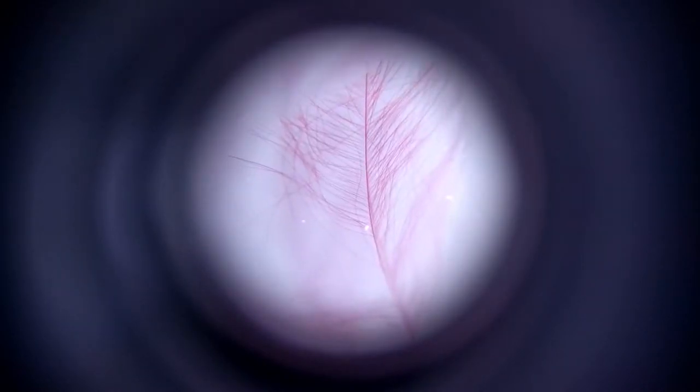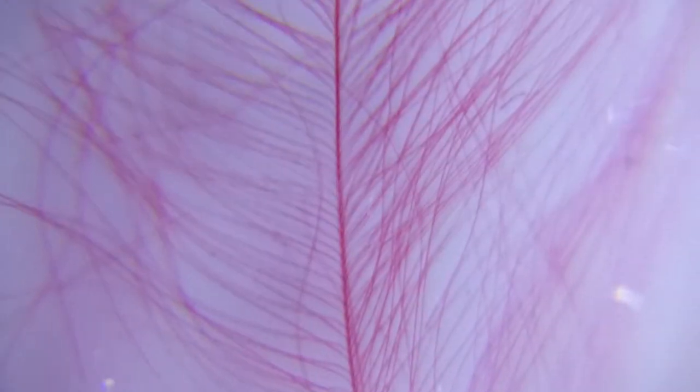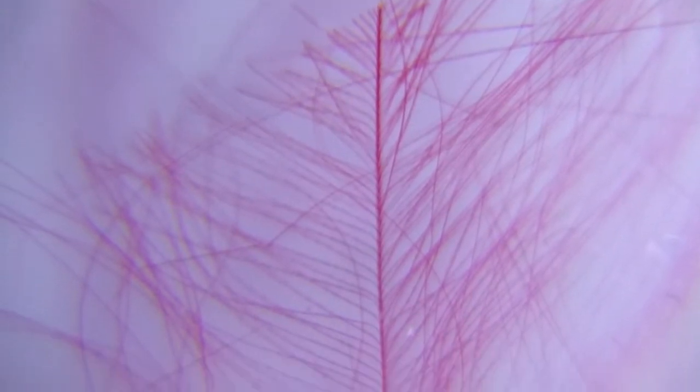Here is the feather, the duck feather, and it actually magnifies it a lot. Let me just zoom in and see some cool things here. Probably the resolution won't be so great, but nevertheless we can see every hair of the feather. You're seeing every single hair of the feather.